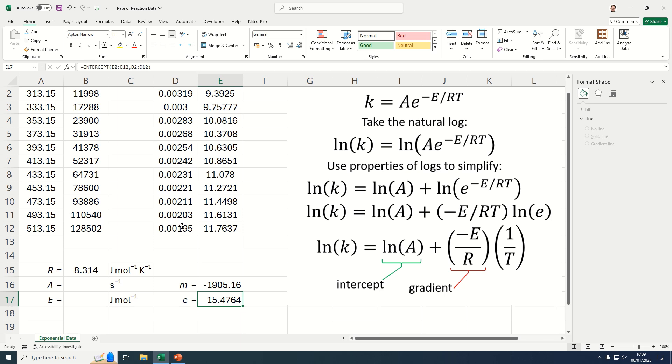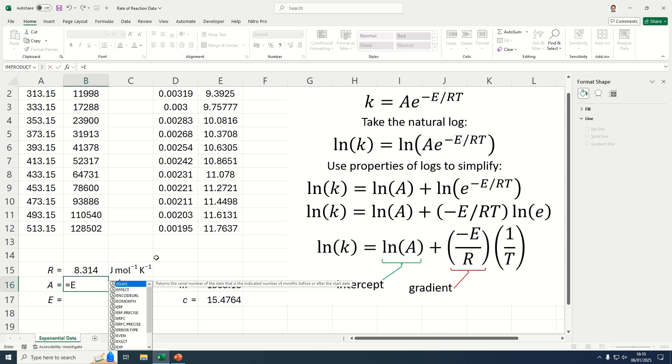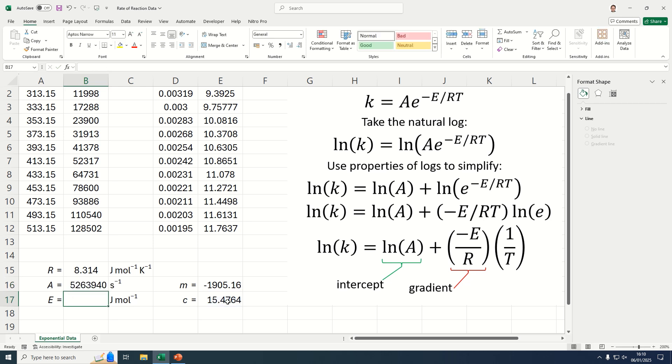So we know that the intercept is equivalent to natural log of A. So to get A we're simply going to do EXP of that value, close the brackets, and that is our pre-exponential factor.